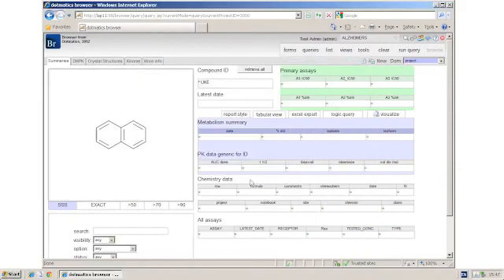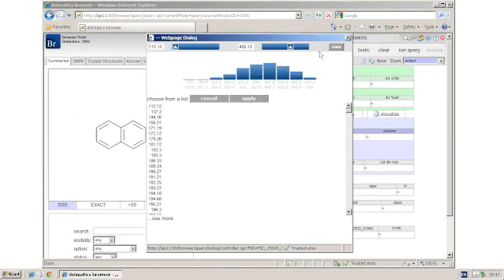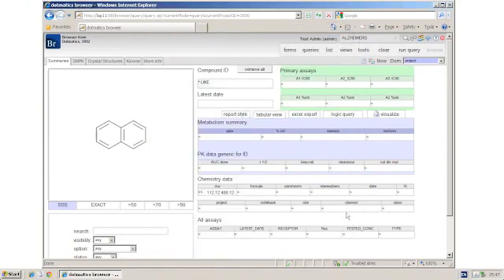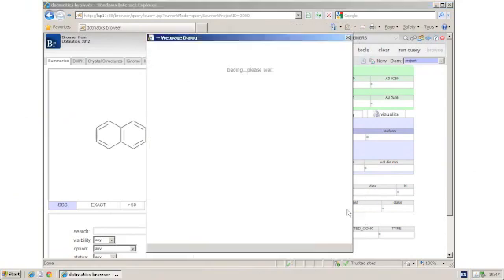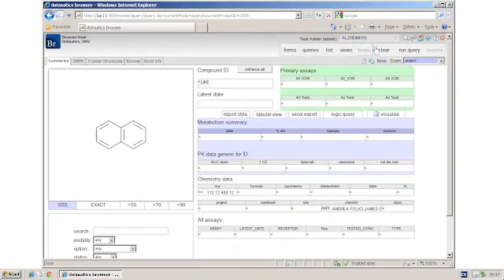Let's also query on some other elements of the form. I can query on molecular weight and choose a molecular weight range. I also wish to choose which chemists I want to see compounds from and then run query.